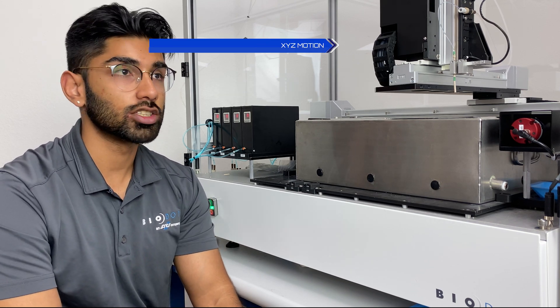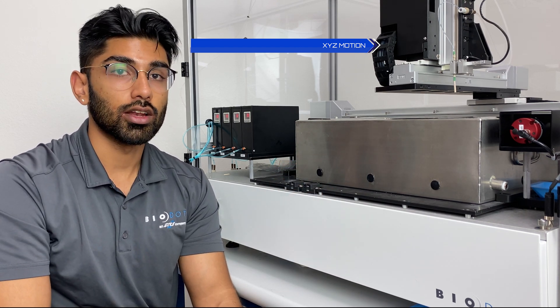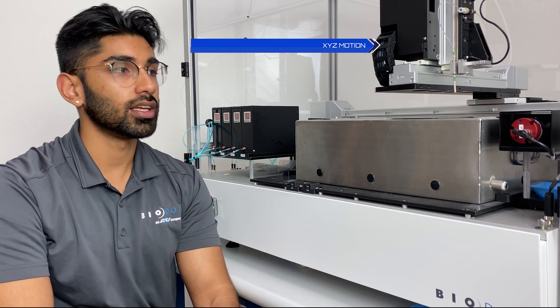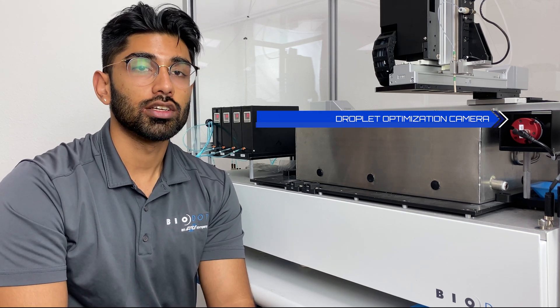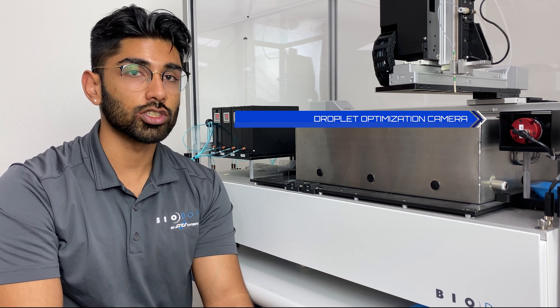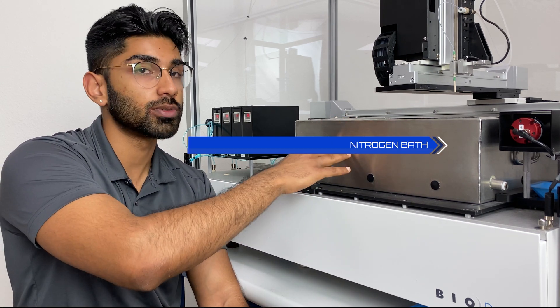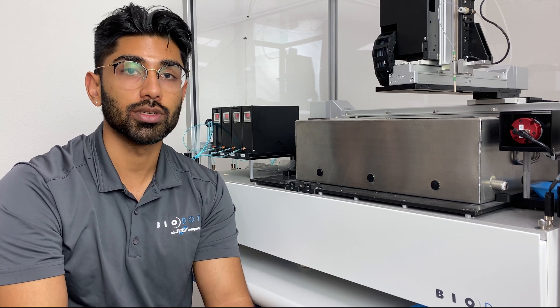The dispenser is connected to an XYZ motion robot that allows for precise movement in all directions. A very unique feature of the Sphere system is the inclusion of a droplet optimization camera, through which you can calculate the exact volumes that are being dispensed prior to every run. Once that is all set up, the drops are placed into the liquid nitrogen bath, which can first be loaded with liquid nitrogen and has a separator and a tray to separate the beads during the lyophilization process and also to capture beads afterwards.